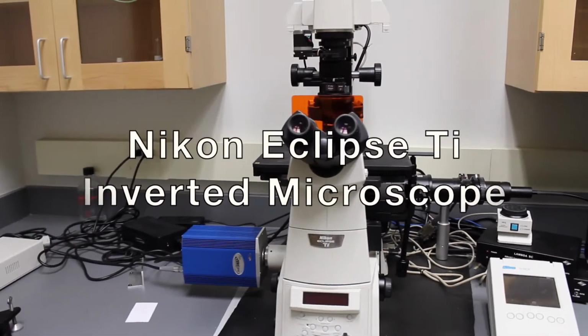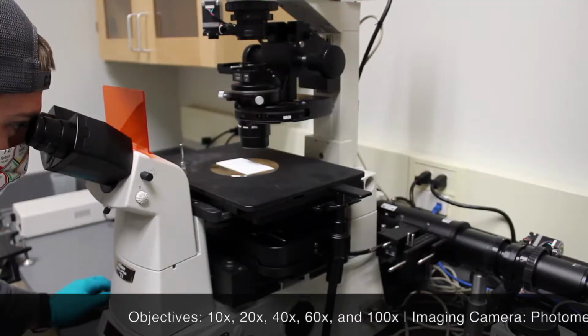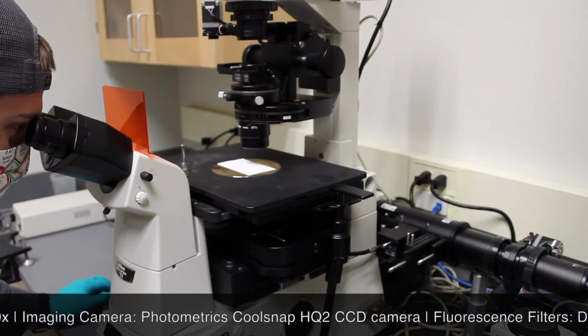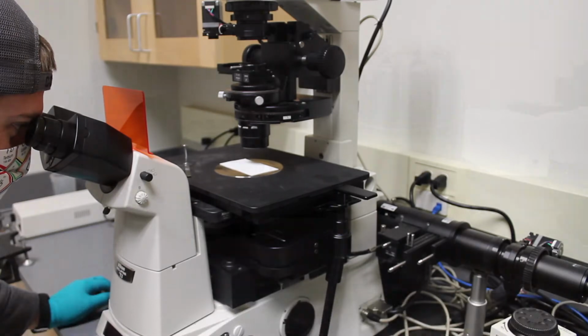Our inverted microscope is primarily used for observing biological specimens. Bright field, differential interference contrast, and epifluorescence microscopy are the observation methods available for this instrument.